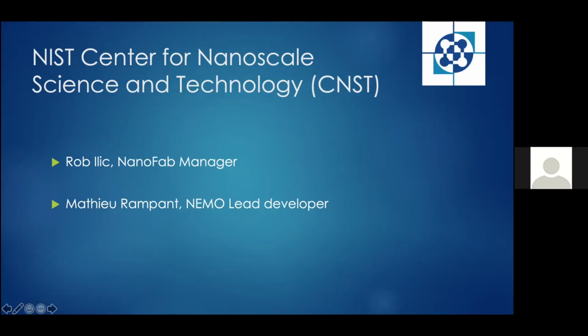One of the developments initially that we discussed were these plugin features. If you're familiar with ImageJ and how plugins work with ImageJ, it took a little bit of time, and as Mathieu mentioned in his previous slide, he developed a way where you can utilize the code base of NEMO and add plugins.